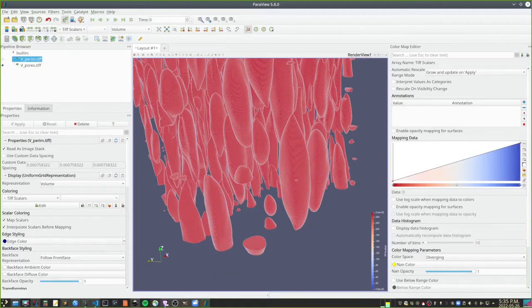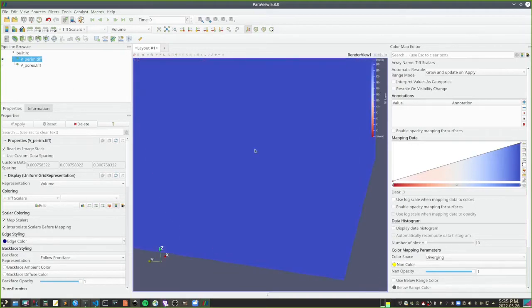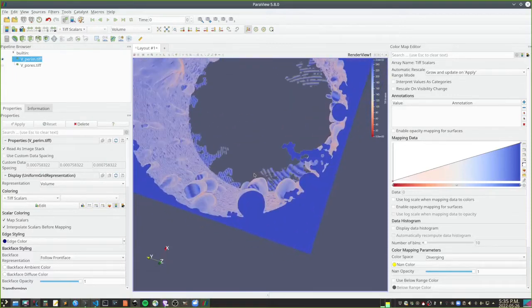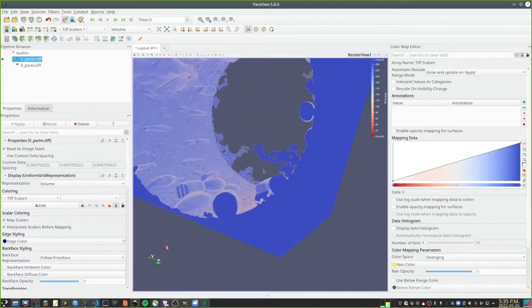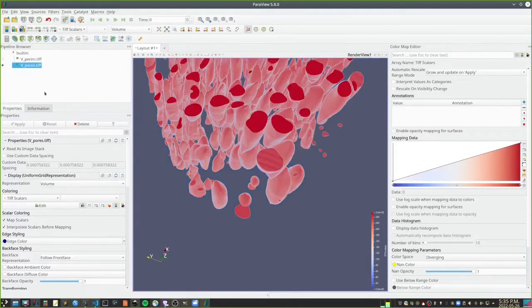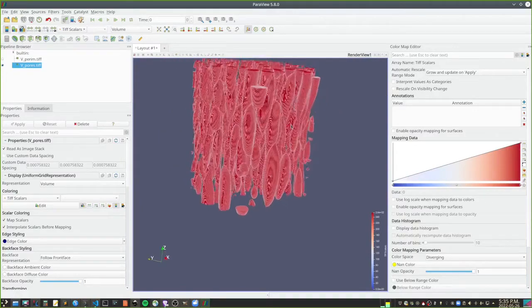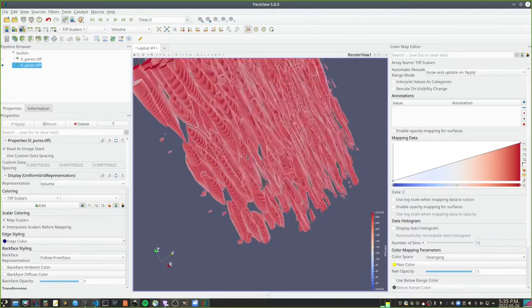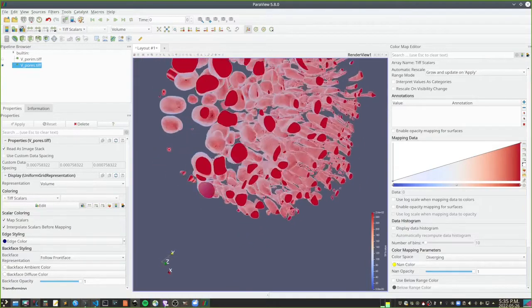Like, we can see them here. Some of these bubbles are actually porosity, they're not perimeter. But still, on the side it's not really that bad, though there might still be a few places on the inside where it didn't catch the entirety of the pores, but it looks decent.